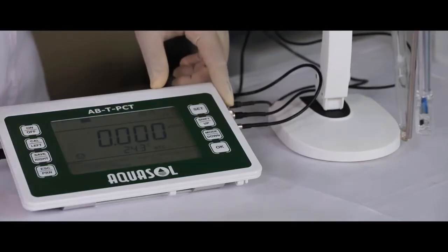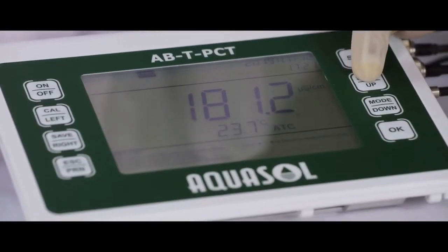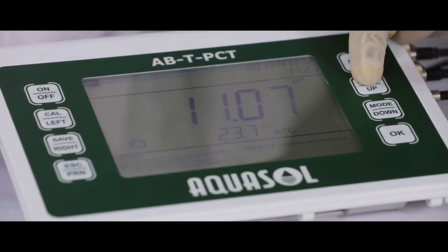Switch on the meter. Using the shift key, you can shift between pH, ORP, and conductivity.